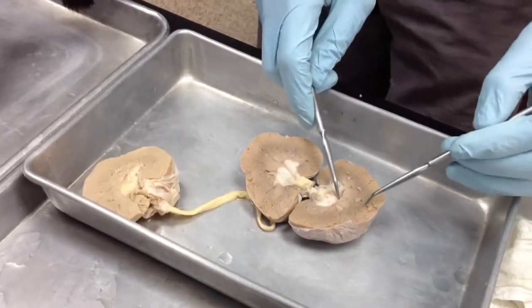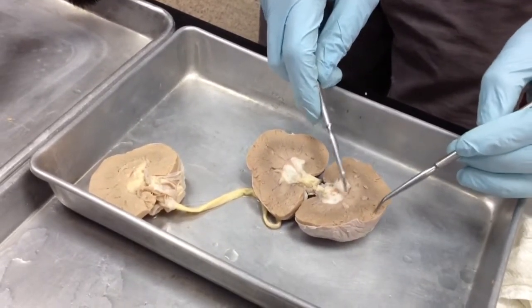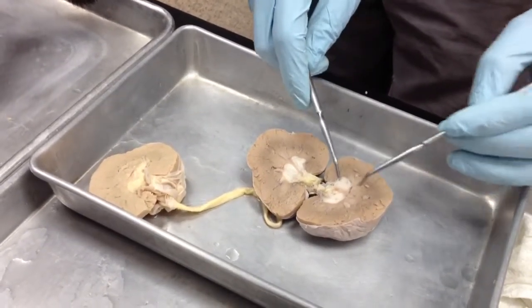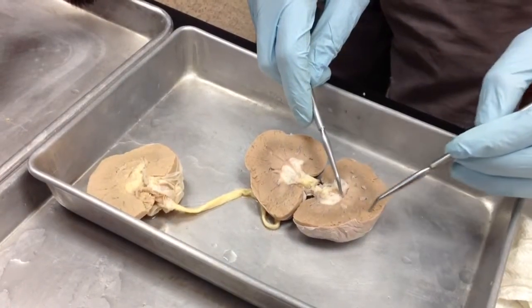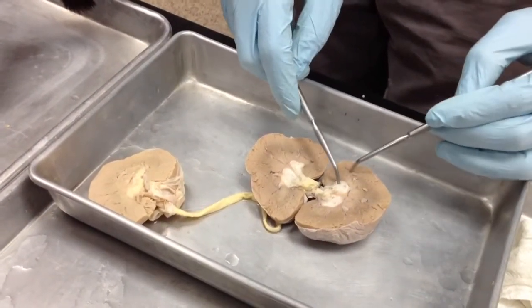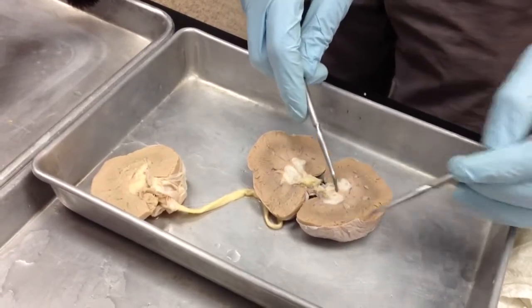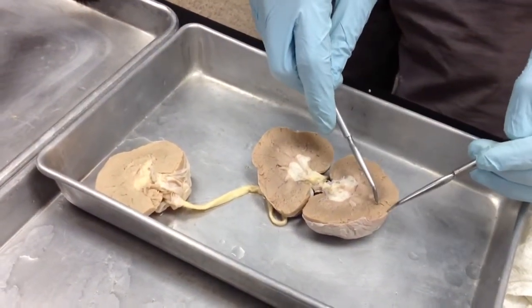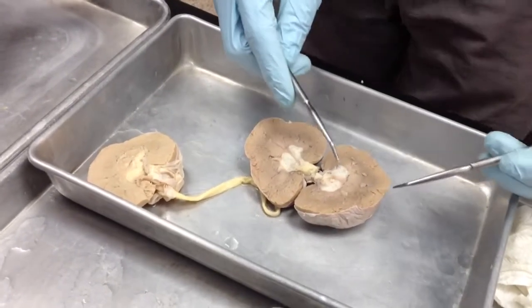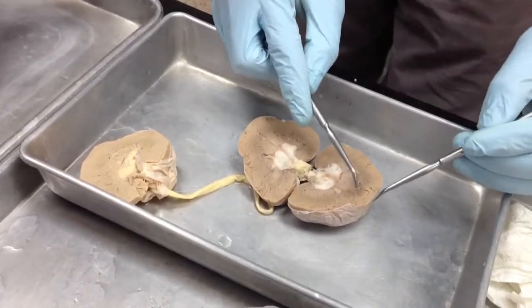Between the renal pelvis, you can see how that's kind of lighter right there on the edge. See that area right there? How that's lighter in that area? So between the renal pelvis and the edge of that darker area is your renal medulla. You see how that's kind of tracing it there? So that section is your renal medulla. And the very outer edge is your renal cortex. Hopefully I'm saying that right. Yeah, renal cortex.